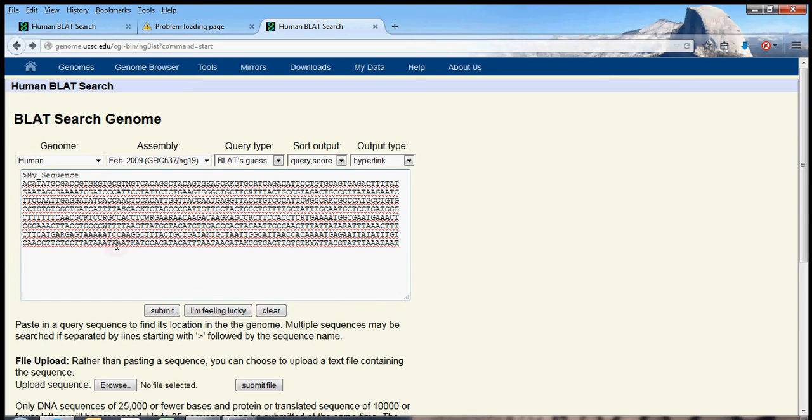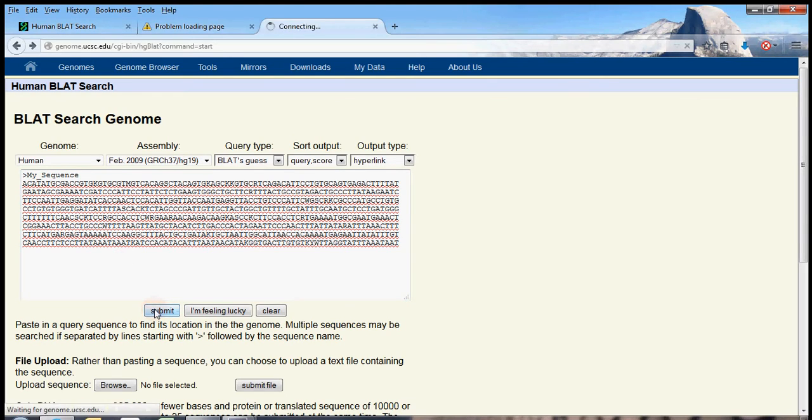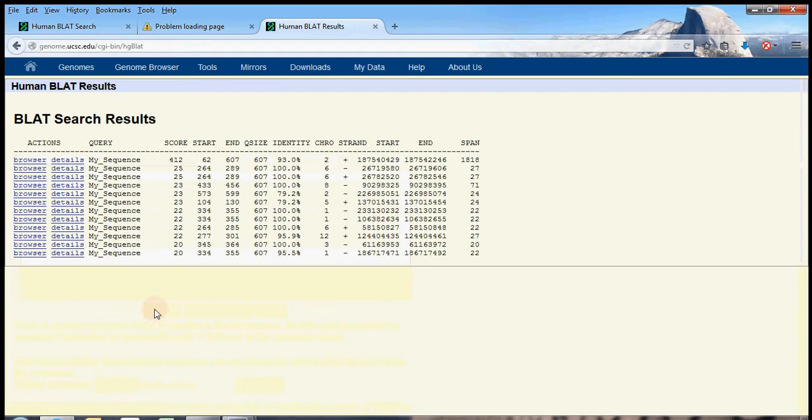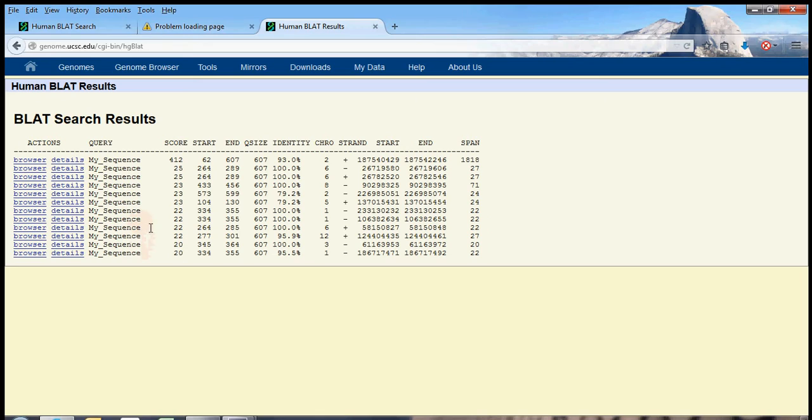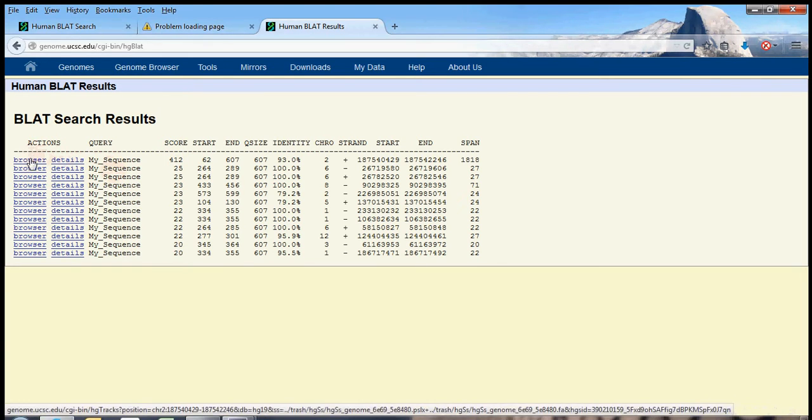So why don't we submit this sequencing result, and see where it actually came from. Now, wow. Okay. So you see right away that we had one sequence to submit, but we got about ten responses. Ten different ideas that BLAT had of where our sequence could have come from. But you'll see at the top, one of our responses had a much higher score than any of the others, and this is probably the correct map of the sequence. Let's go to the genome browser and see where BLAT thinks this sequence came from.